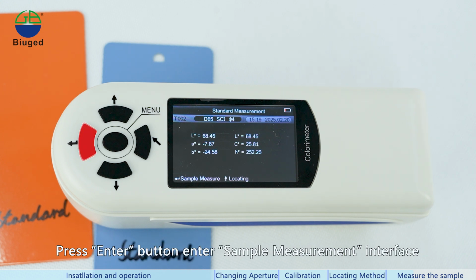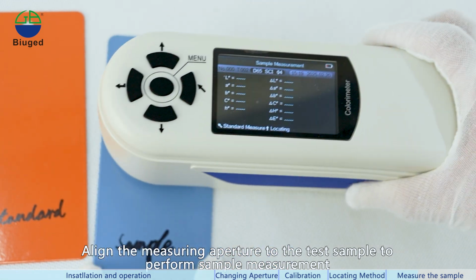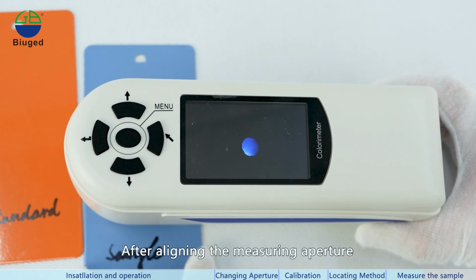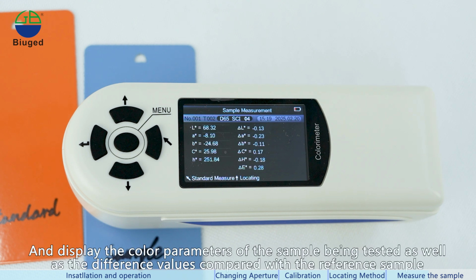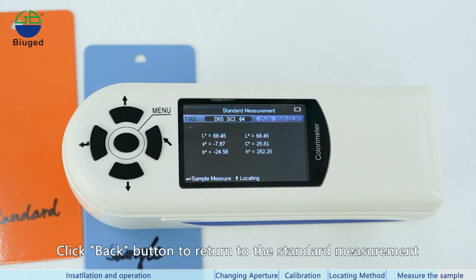Press the Enter button. Enter the sample measurement interface. Align the measuring aperture to the test sample to perform sample measurement. Please click the up button. Camera locating is starting. After aligning the measuring aperture, press the testing key and complete the color measurement of the sample within 2 seconds, and display the color parameters of the sample being tested as well as the difference values compared with the reference sample. Click the back button to return to the standard measurement.